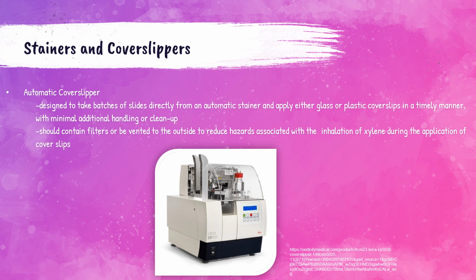Automatic cover slippers, as seen in the photo on this slide, do what you think that they would. They take slides and apply either glass or plastic cover slips to them. These are obviously very helpful and reduce time in cover slipping if compared to doing it manually.